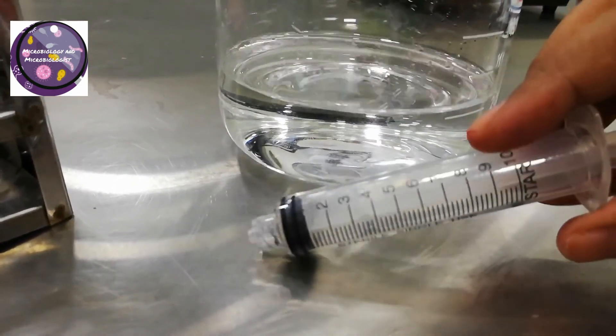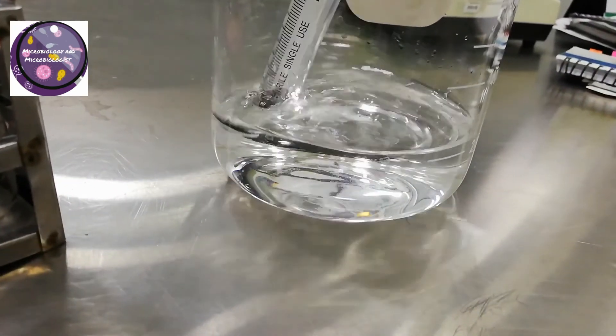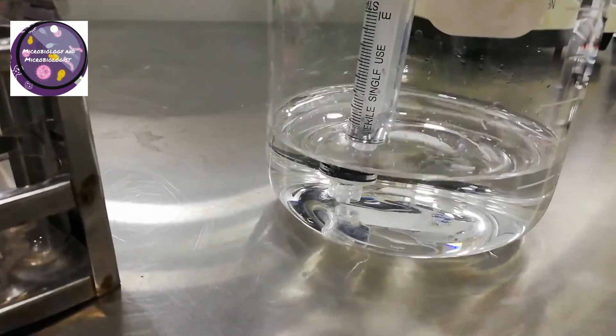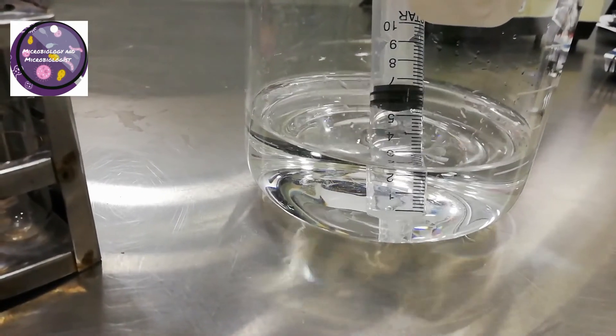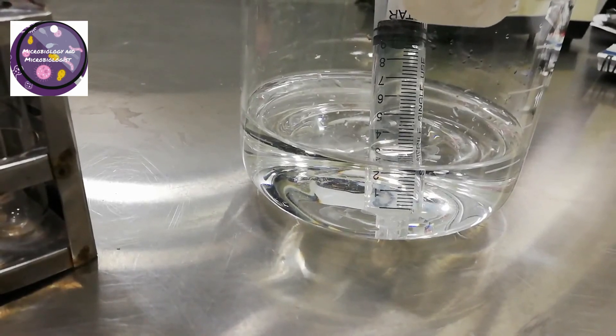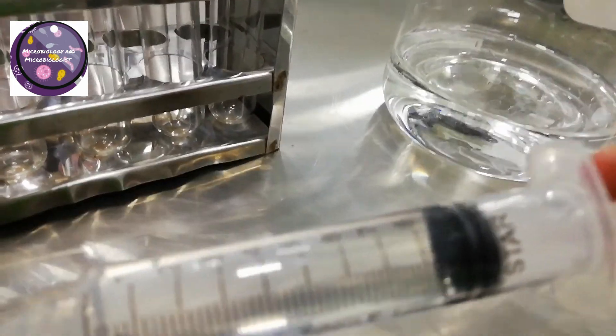Now I have mixed it properly, and I am going to use this 10ml syringe to dispense the liquid into these 15ml culture tubes.